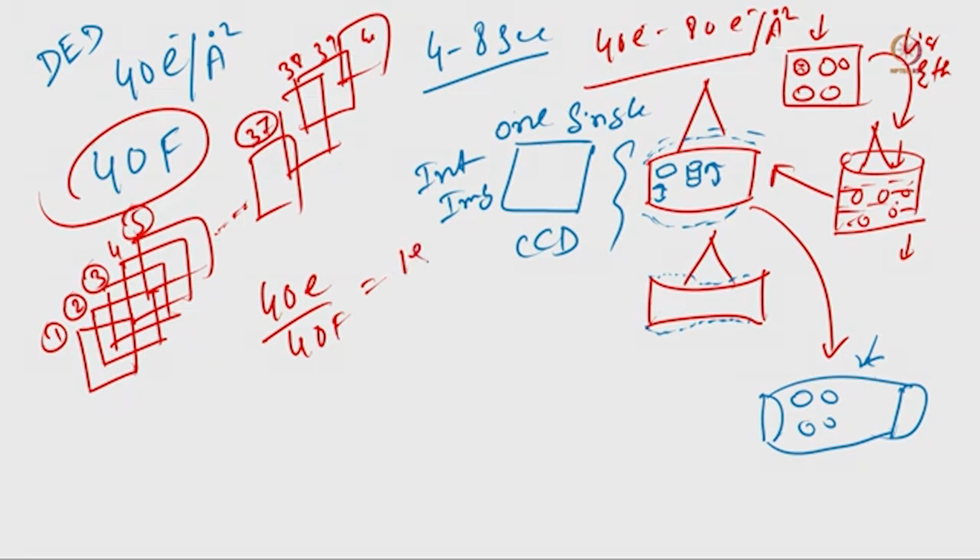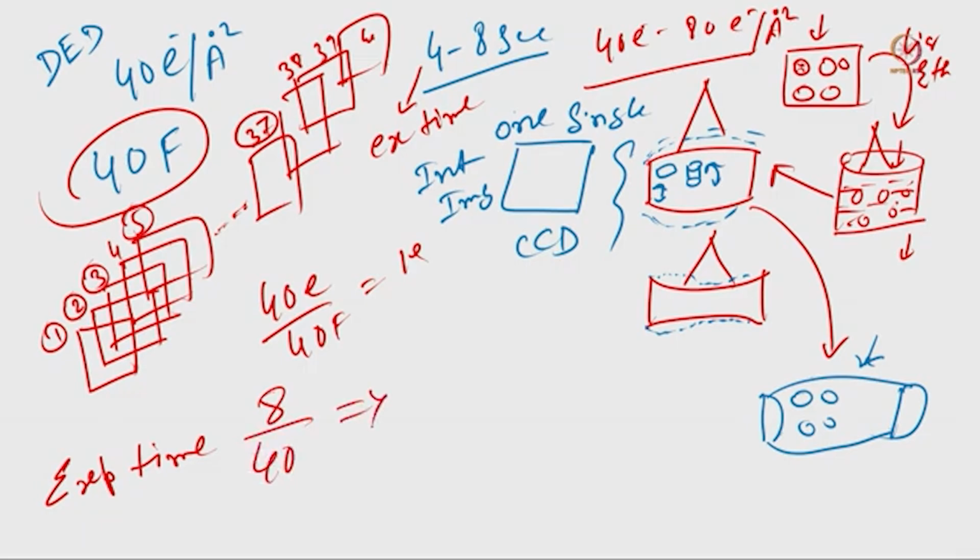And now, this is our exposure time, right? If this is my exposure time, 8 seconds, and 40 frames, you will get how many seconds per frame.